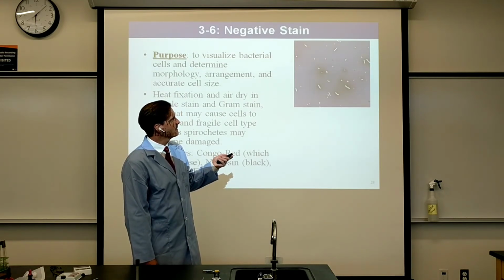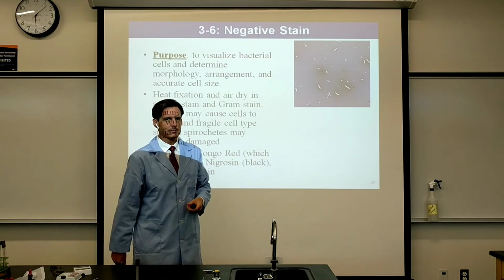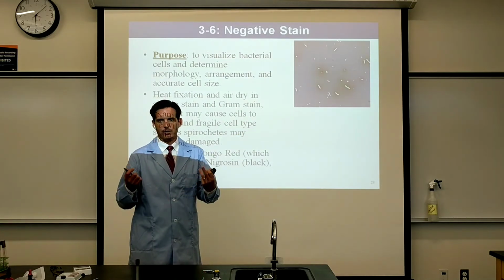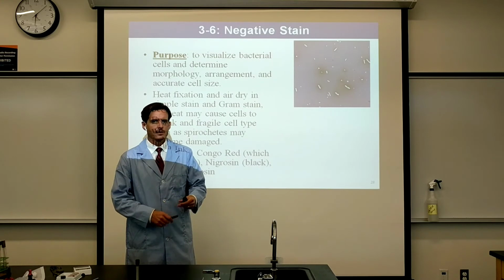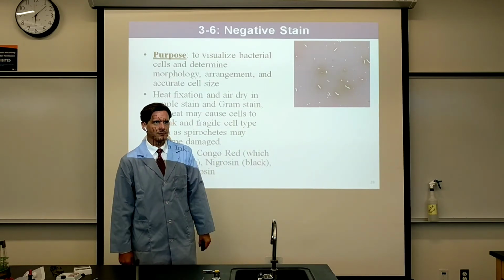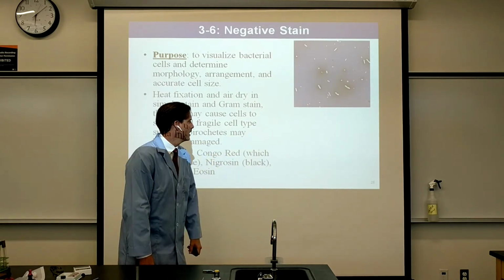You may find some little coccus, spherical-shaped bacteria as well that are not just simply specks of dust. The things that are not bacteria, that are junk or whatever, are referred to as artifacts. Artifacts appear in slides all the time, and we want to be able to look for the actual bacteria and not mistake the dust and things like that, the artifacts, for bacteria.